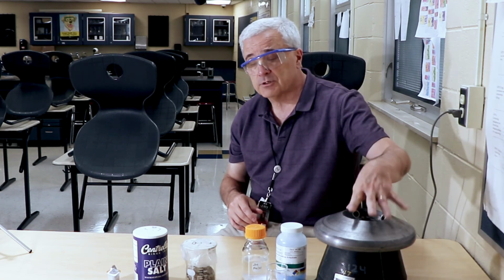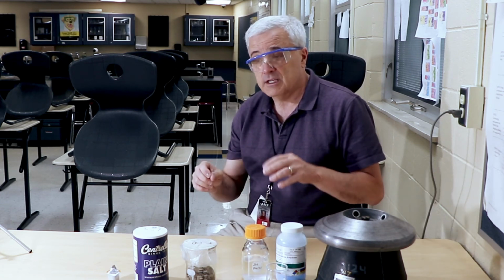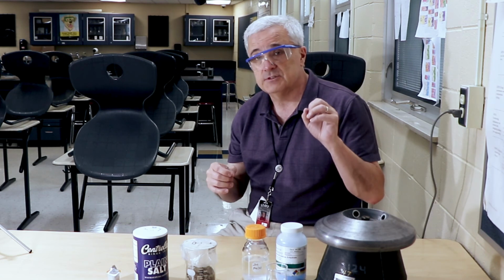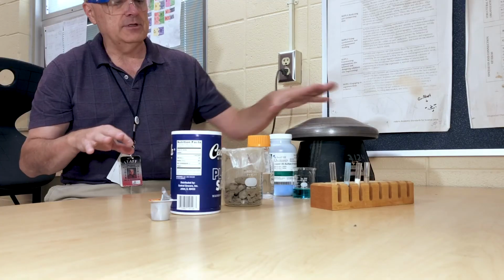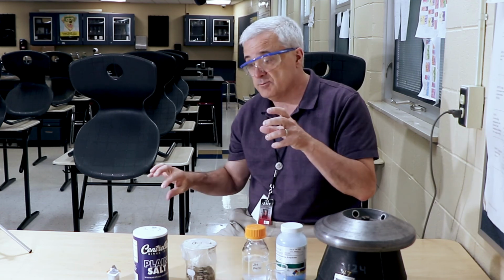That is it for this demonstration. Hopefully this was helpful. Hopefully this will let you see how centrifugal separation works, gives you some examples that you can use and visualize that process, and understand that it only answers the question, is it a suspension or is it not a suspension? It doesn't tell us if it's a pure substance. It doesn't tell us if it's a solution. It doesn't tell us if it's a colloid. There will be other tests that would answer that. But this separates particles by their density. It'll separate a mixture. The densest particles will go to the bottom of the test tube.